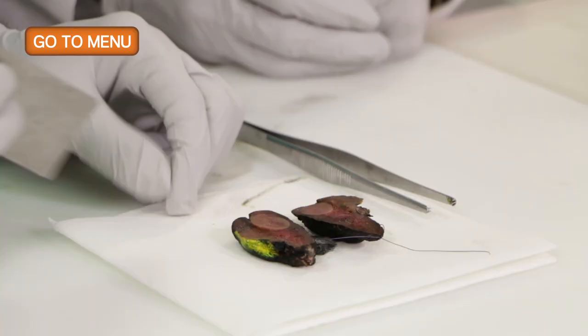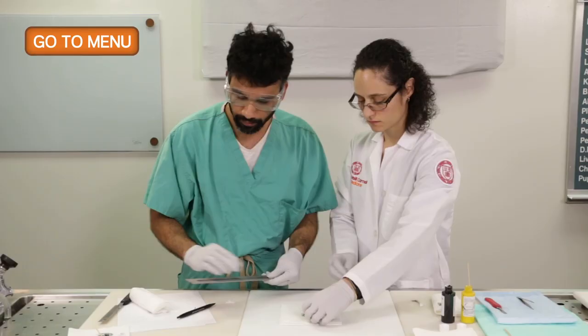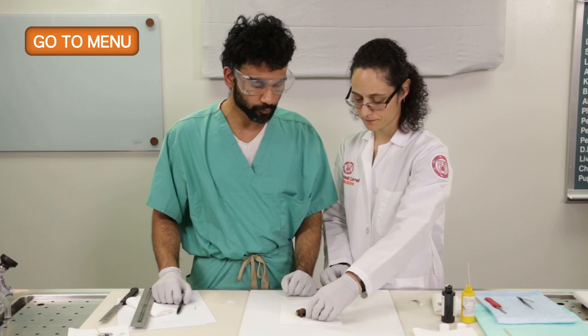Correct. So the lesion measures 2.1 in the long axis, 1.3 in the short axis, and then I'm going to try to approximate the height. So the height is about 0.7. The largest dimension in this case is 2.1, which is still above 2, which correlates pretty well to what they saw preoperatively on the ultrasound.